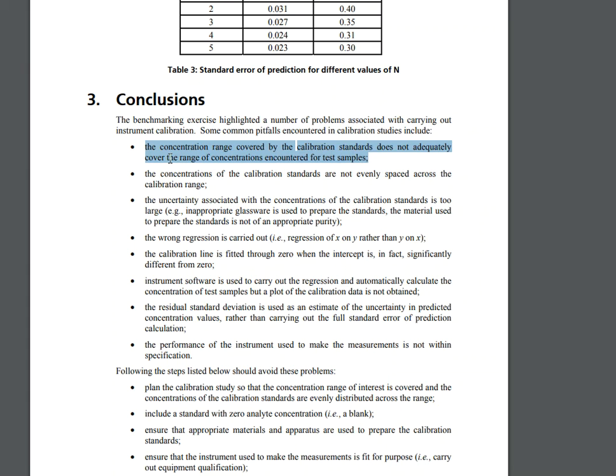I either have to dilute them if they're too high and run them again, or redo a calibration curve and incorporate a higher standard to include that sample. And if they're too low, then that's a problem as well. I have to basically say it's lower than the MRL.